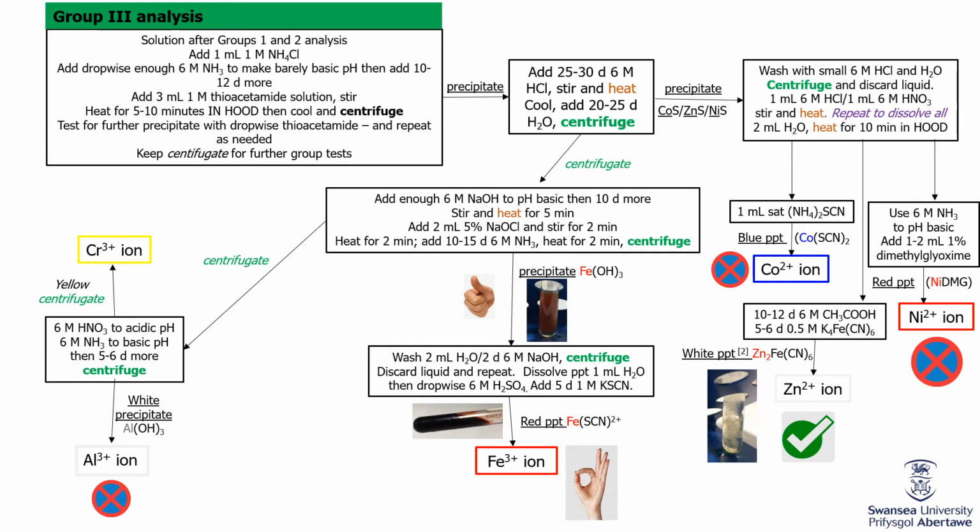And the same can be done to show whether there are any chromium 3 plus ions involved in the solution, but in this case there weren't any as well.